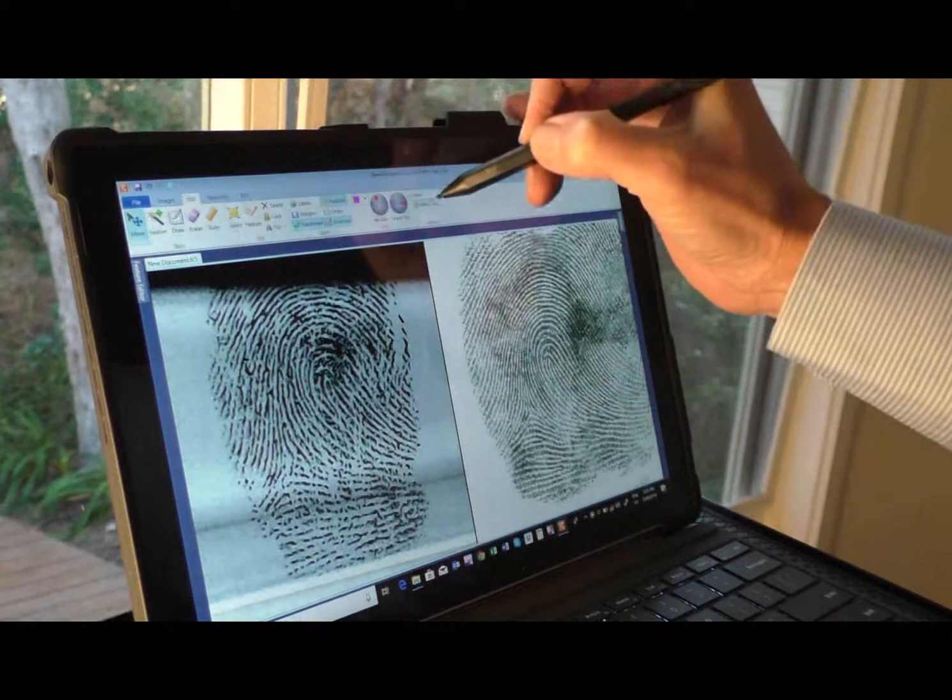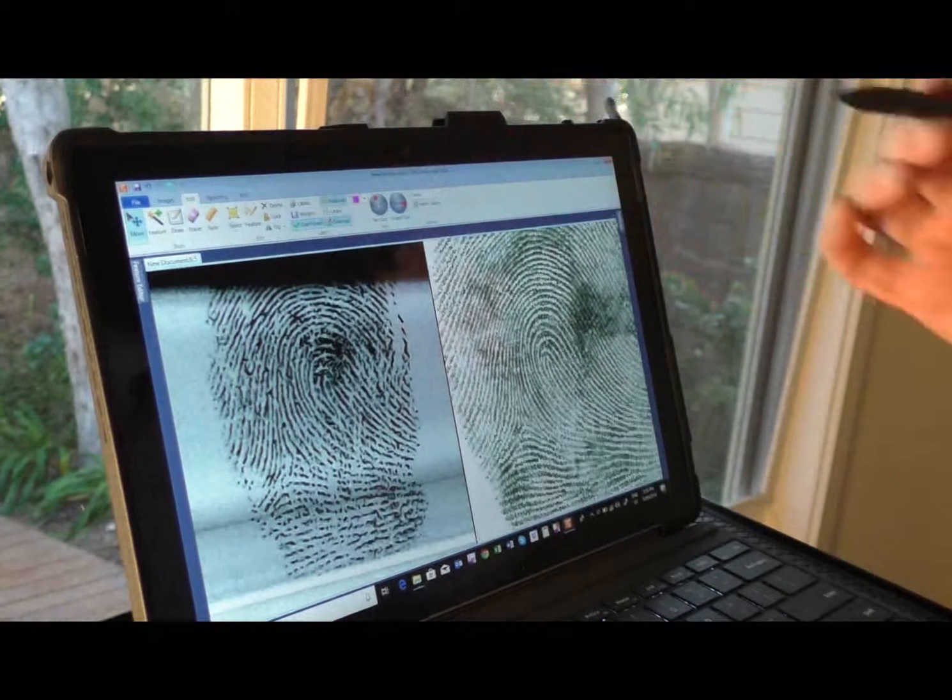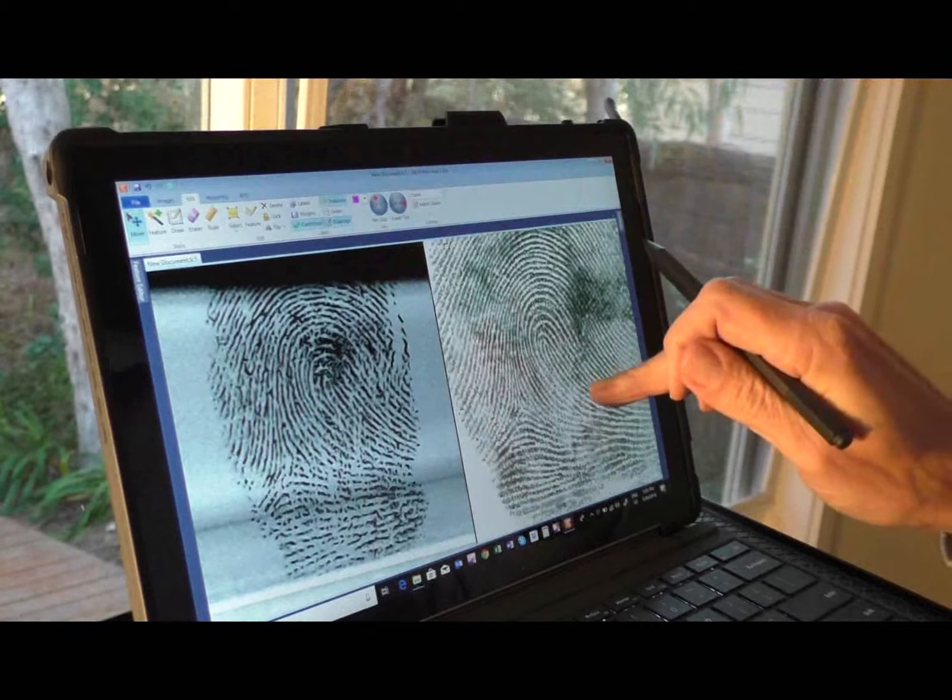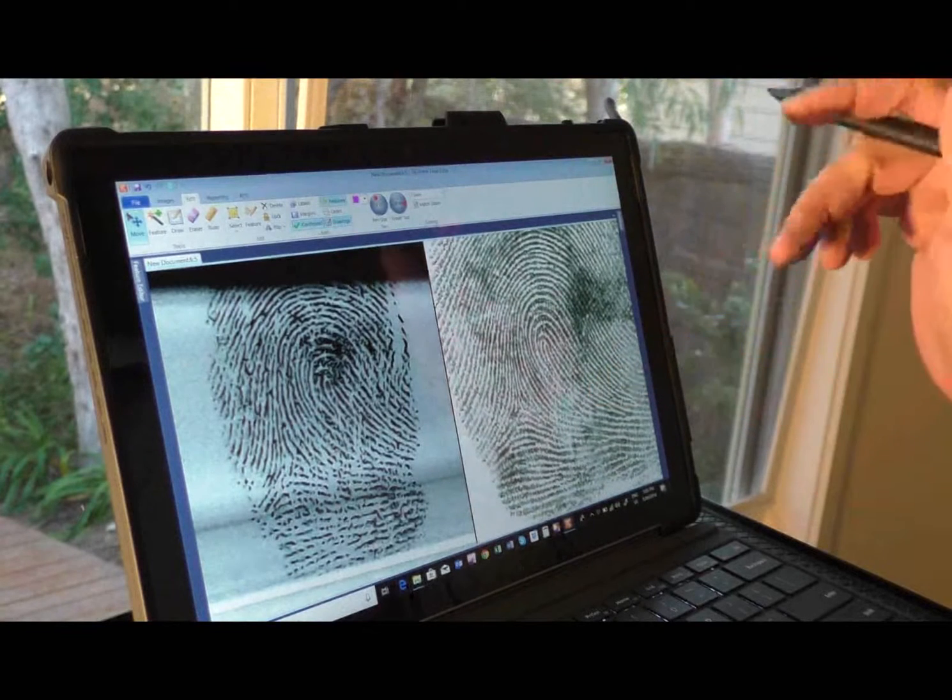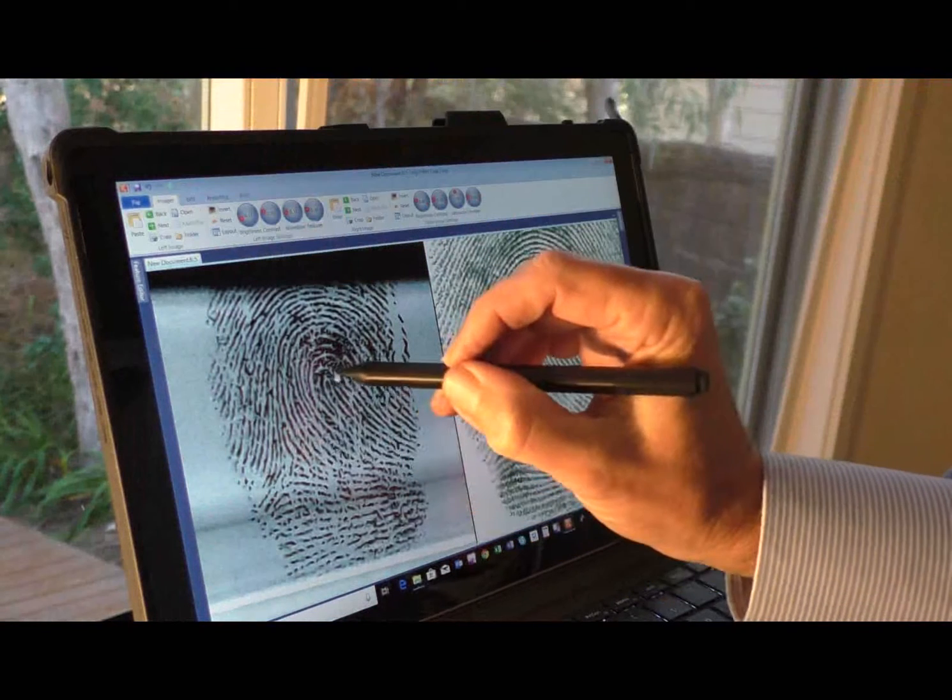The match zoom tools can then be used to precisely equalize the zoom of the impressions. A manual comparison can then be conducted.